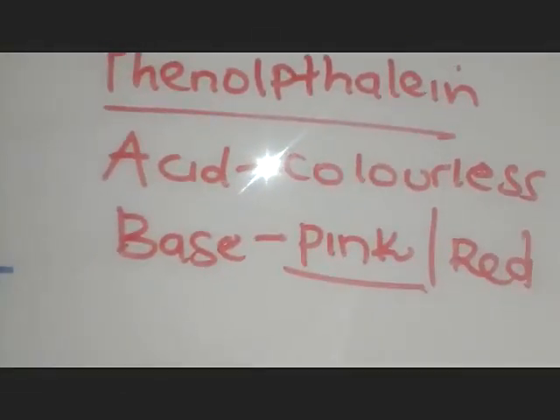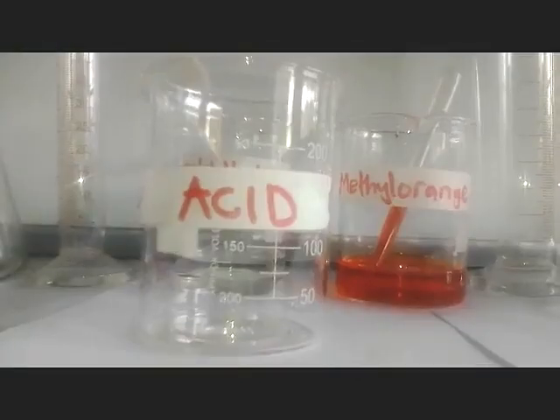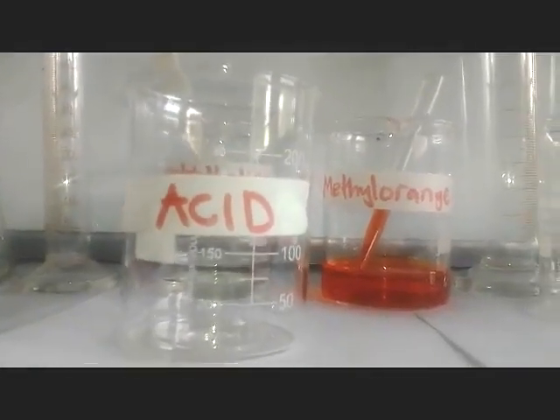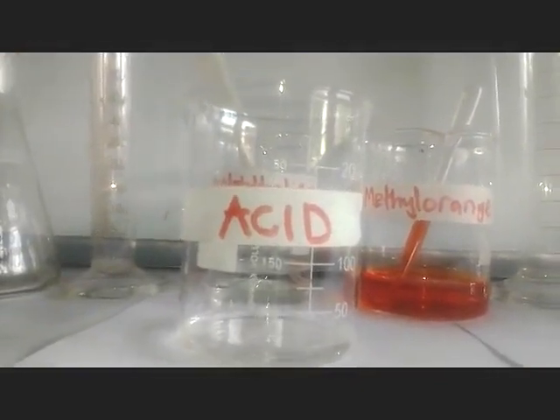So what do we mean? Let us try to demonstrate it practically. I'm going to get my acid here. This is my acid. I get my beaker and I put the acid there. Someone may doubt that that is an acid.